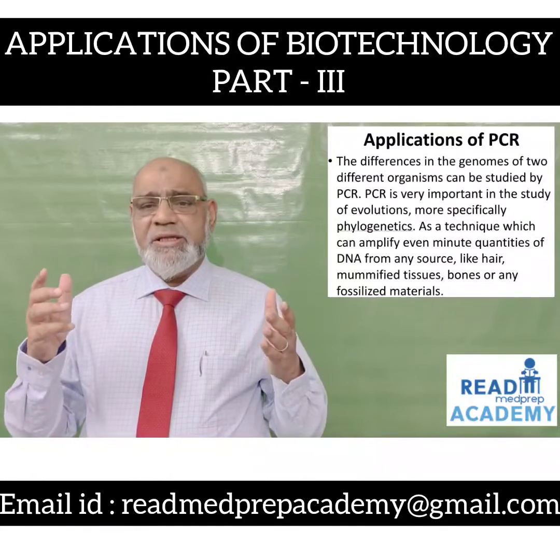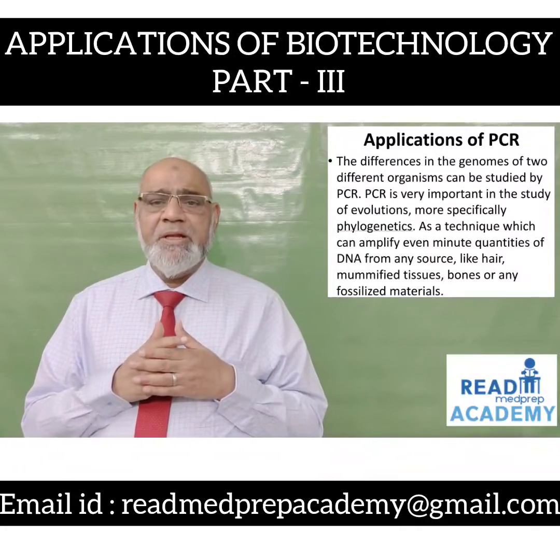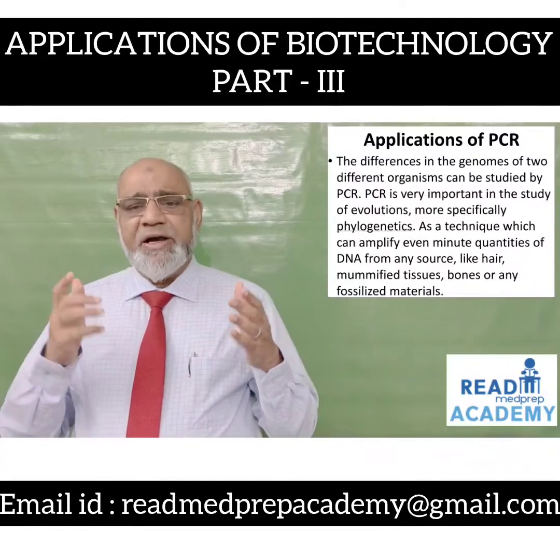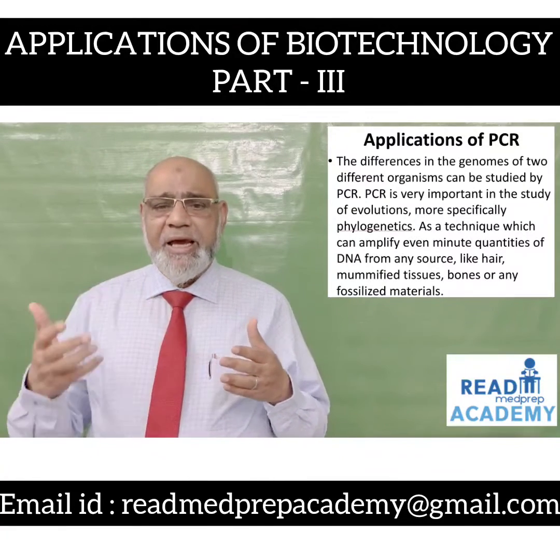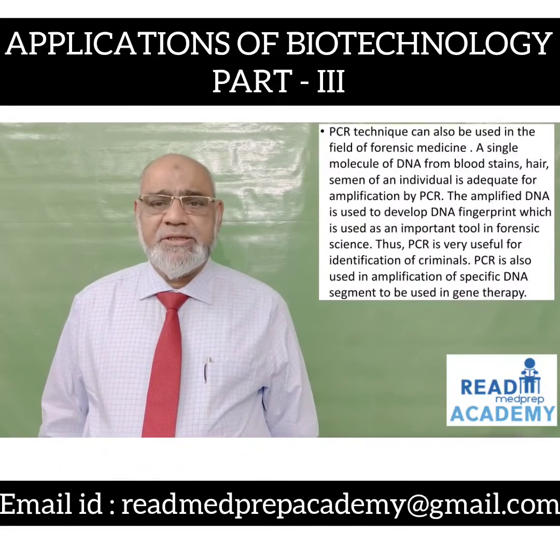The differences in the genomes of two different organisms can be studied by PCR. PCR is very important in the study of evolution, more specifically phylogenetics, as a technique which can amplify even minute quantities of DNA from any source like hair, mummified tissues, bones, or any fossilized materials.